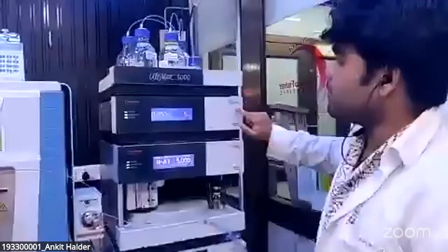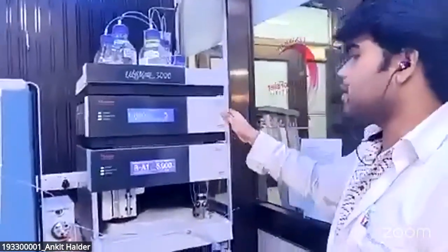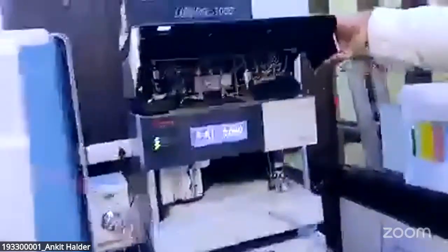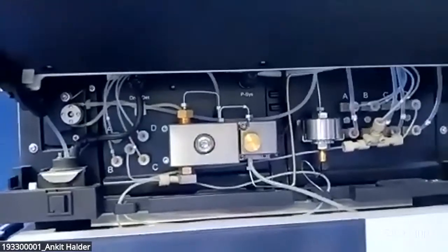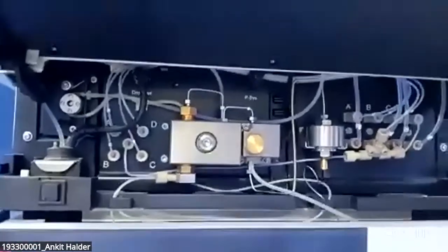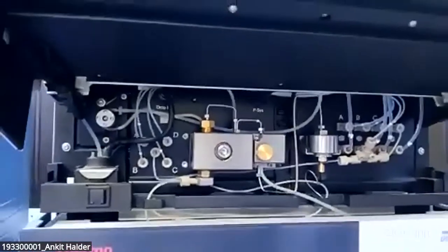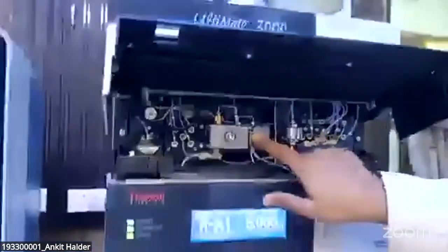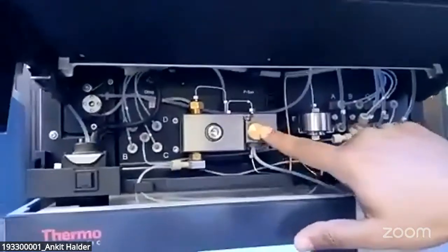The third compartment from the bottom is the pump compartment. So the pump compartment, let me open this pump compartment. It will give us the feature of pulse-free flow. It means there will be uninterrupted flow of the solvents, and it will also get rid of any kind of back pressure fluctuation. This is another important thing that you can see. It is a knob, basically for the purging system.